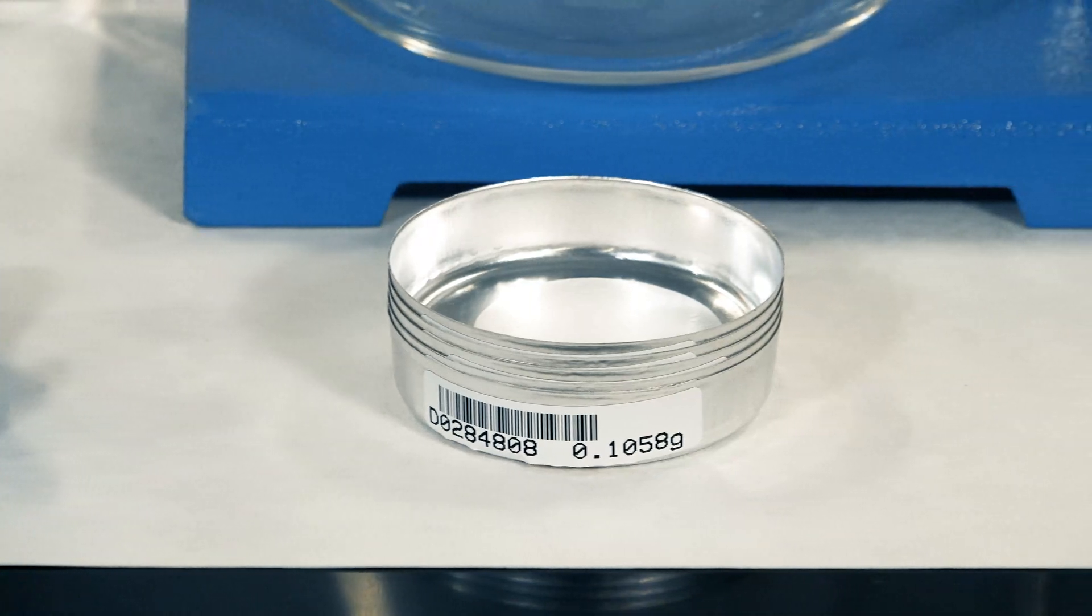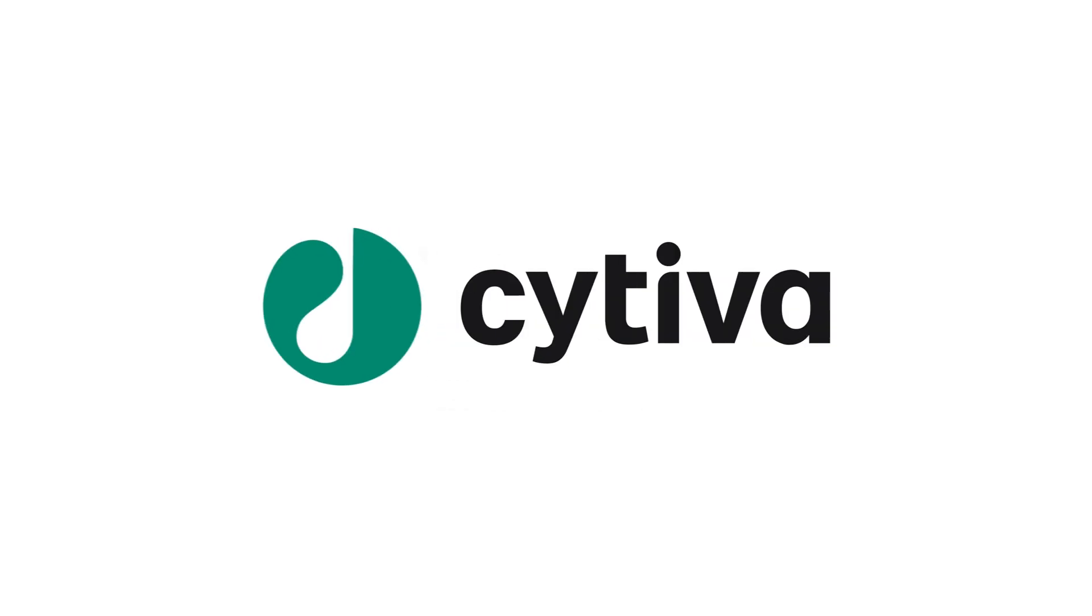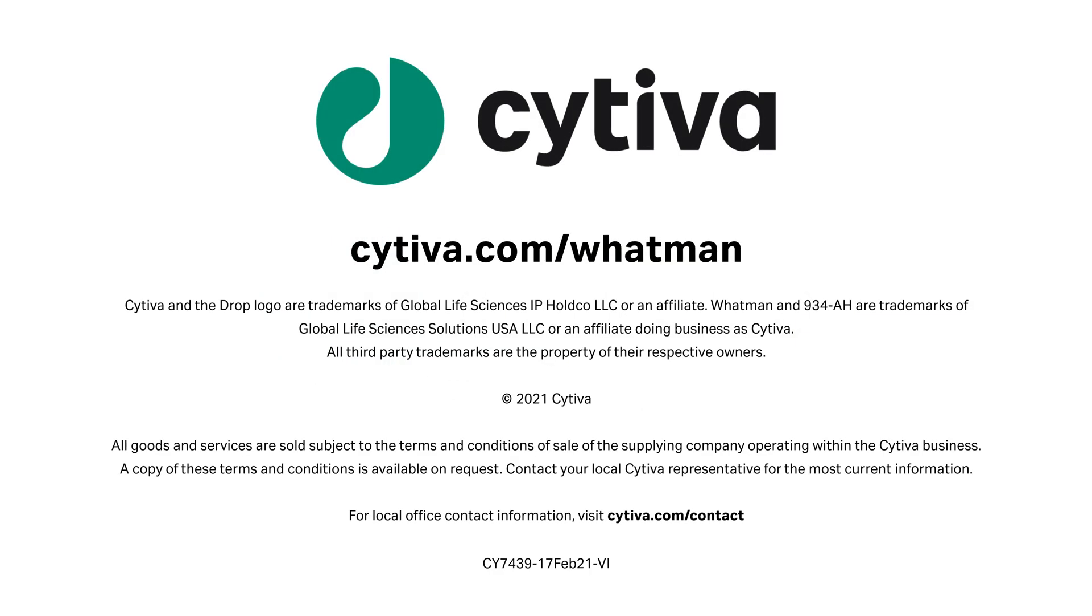So, what's the difference? The 934 series of glass microfiber filter papers from Cytiva. Your choice for convenience, speed, and efficiency.